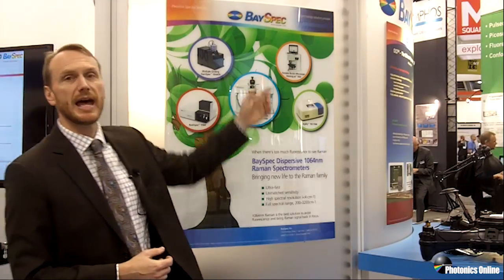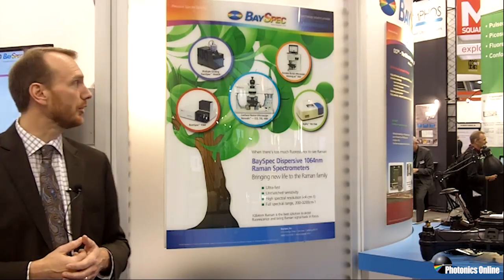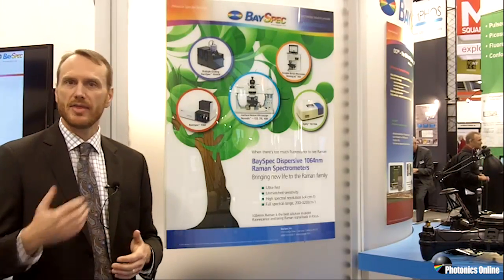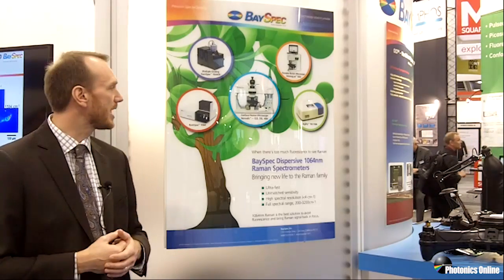We have what we call the Moving Lab 1064, so you can actually take your lab into the field and measure live samples there. Same as the Agility, it has a battery pack so it can be used without external power. We also have our RAM Spec Raman spectrometer, and for applications that demand higher resolution and deeper cooling, we have that option as well.